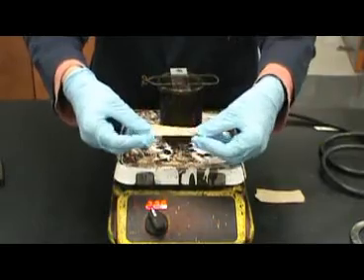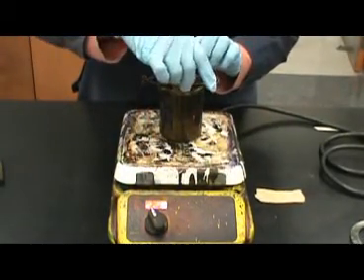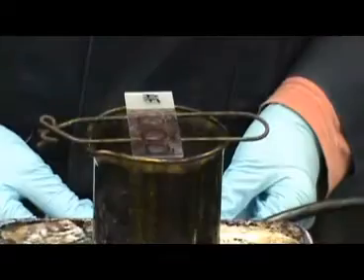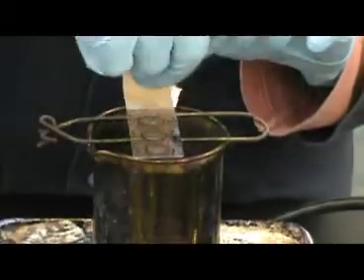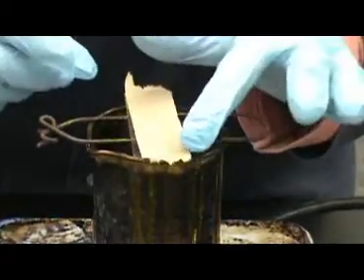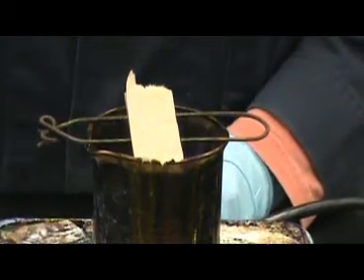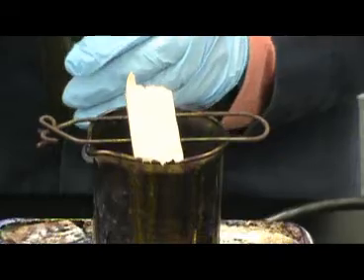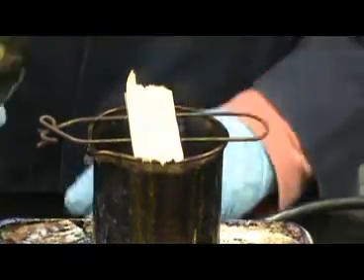A small piece of paper towel has been cut out that is about the size of the actual slide itself. The paper towel is placed down on top of the slide, and then the primary stain, carbol fuchsin, will be added. The paper towel serves 2 purposes. One is to prevent the stain from running off of the slide during steaming. The second purpose of the paper towel is to prevent the stain from drying out due to the steaming.